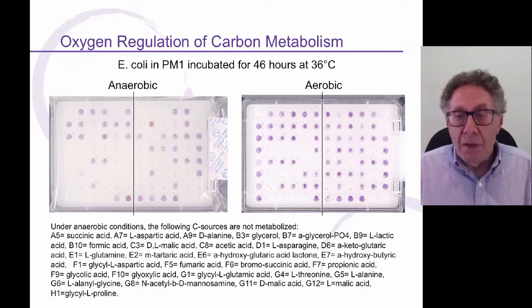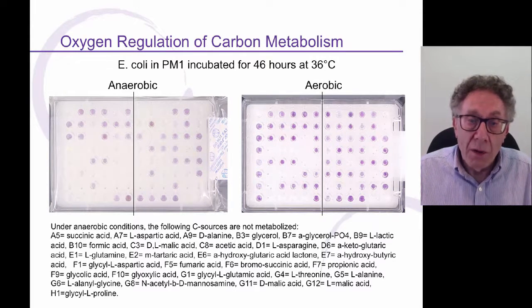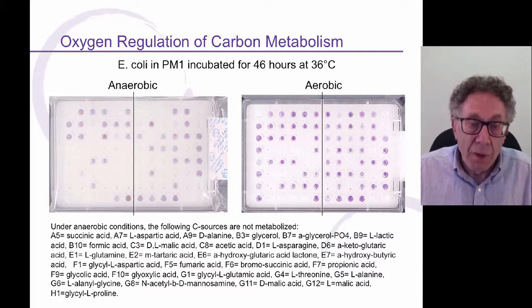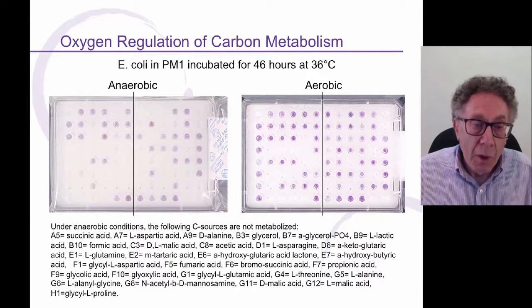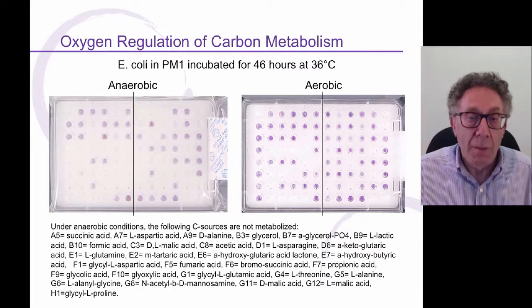So in terms of the effect of the gas environment of a cell, here's a simple experiment where we compared the carbon metabolism of E. coli either in the presence of oxygen aerobically, which is on the right, or anaerobically on the left. And I also like to show this as an example that we can run anaerobic bacteria and bacteria that require special gas atmospheres. Perhaps you can see in this slide that the plate on the left is actually inside of a gas-proof plastic bag with an oxygen-absorbing sachet. But you don't have to use sachets. You can also set these up and seal the bags inside of a gas chamber with any gas atmosphere you desire.